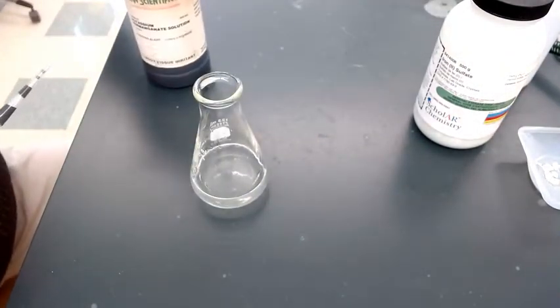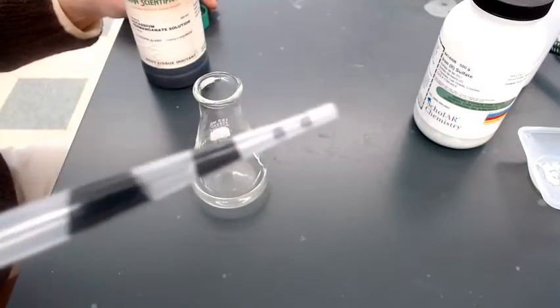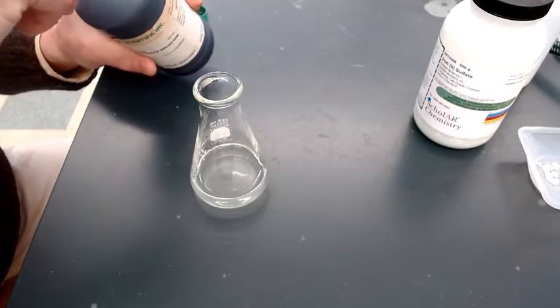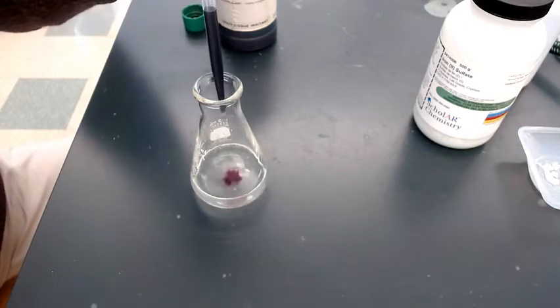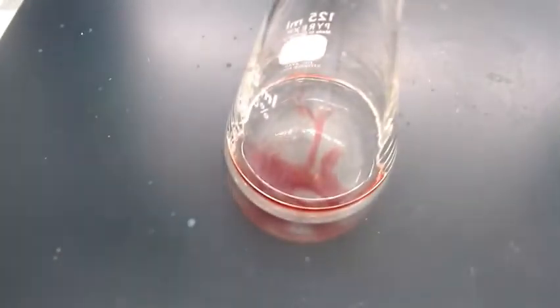The cool thing about this solution is that it's a purple solution, and you'll see that it's purple as soon as I put a couple of drops in the solution here. So I'm going to put some drops in, and you can see the purple color. Let me see if I can get that a little closer. Yeah, so you can see the color, but watch when I swish it.